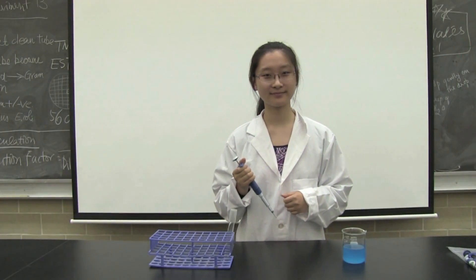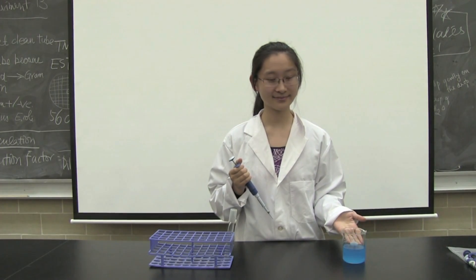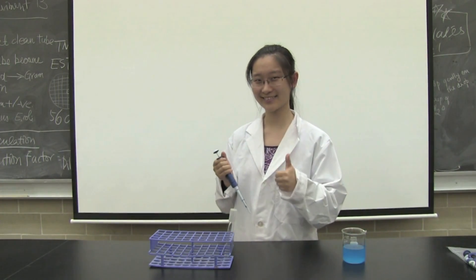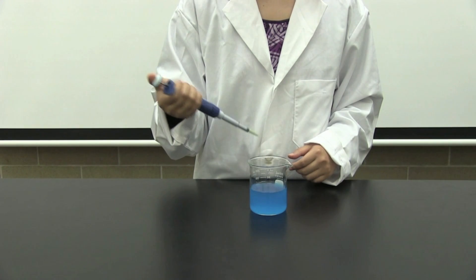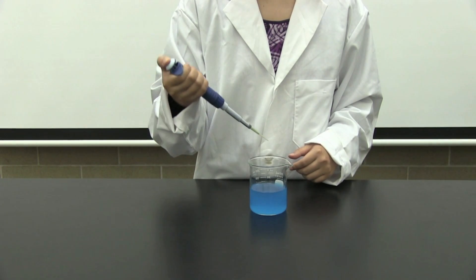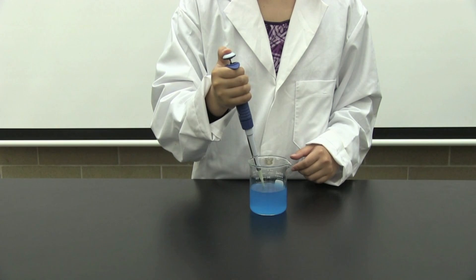Alright aspiring scientists, it's time to transfer some solution to a test tube. Depress the plunger to the first stop. Place it in the sample and release slowly. Make sure that the tip is not at the bottom of the beaker.